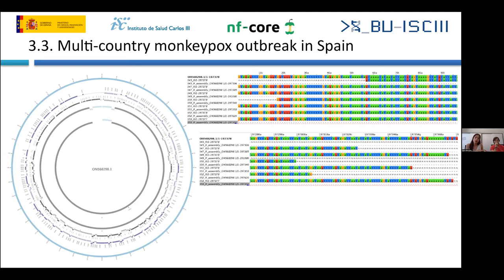We used the mapping consensus FASTA files and the de novo assembly FASTA files to create multiple sequence alignments and see the performance of both approaches. We saw that the ends of the reference genome couldn't be assembled with the de novo assembly approach, but with the mapping approach, we could see that there was enough coverage to obtain those sequences. Also, in the PlasmidID plots obtained with viralrecon, we can see how in the de novo assembly, the right and left ends of the reference genome are missing.